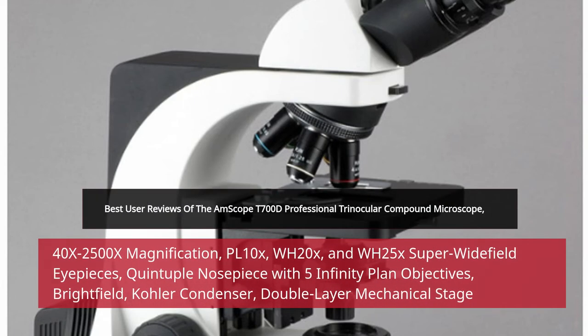Best User Reviews of the AmScope T700D Professional Trinocular Compound Microscope, 40X–2500X Magnification, PL10X, WH20X, and WH25X Super Widefield Eyepieces, Quintuple Nosepiece with 5 Infinity Plan Objectives, Brightfield, Kohler Condenser, and Double Layer Mechanical Stage.